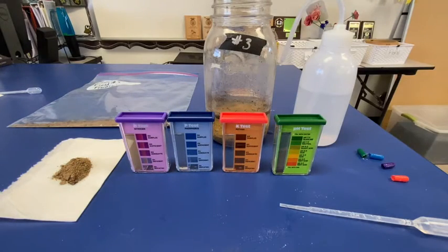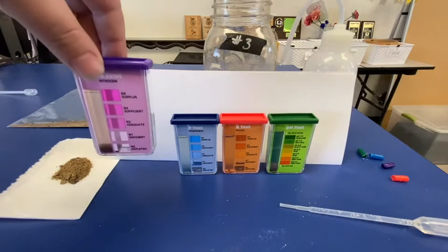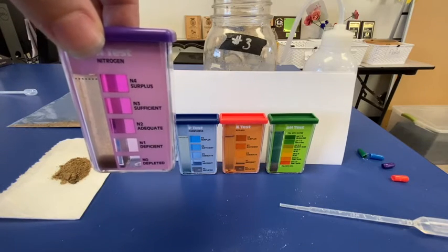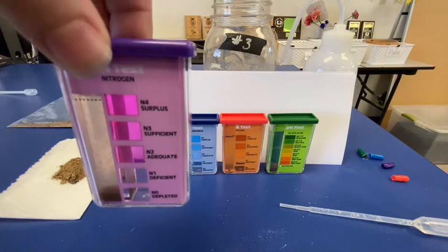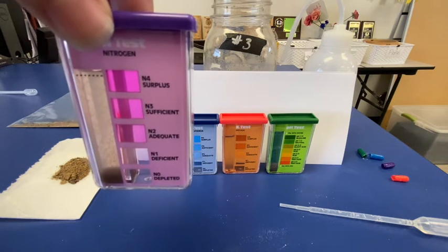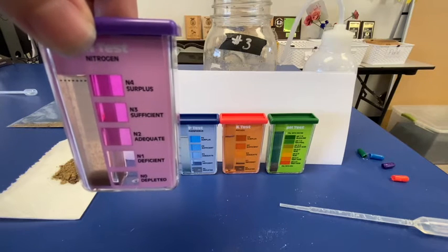You'll see the video begin again after it has been 10 minutes of waiting. It has been 10 minutes. We're going to take a look and see what's going on. Soil profile number 3, so field number 3. This is what we can see for nitrogen. On our slides, we're going to highlight.